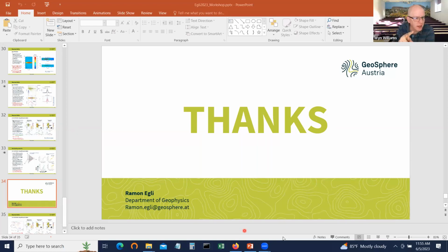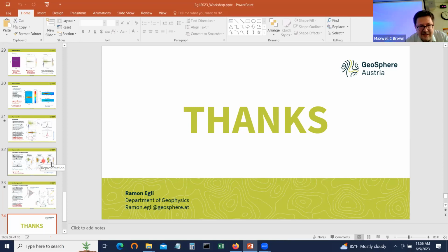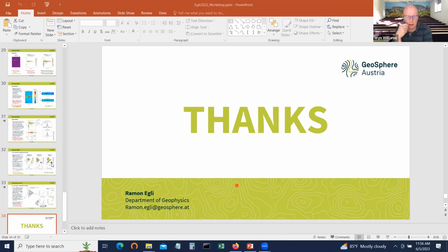There were 2 questions I had, and it's mostly on interpretation, as you might expect, so I don't want to take too much time up on this session. I think it's on slide 32, you showed some very nice FORC diagrams. I was just wondering, will those experimentally measured, because again, you have a very clear vortex signature, which I don't seem to be able to reproduce. I just wondered if it would.